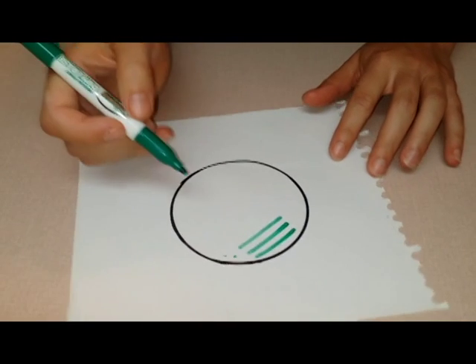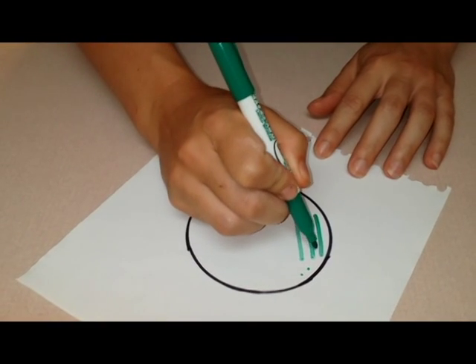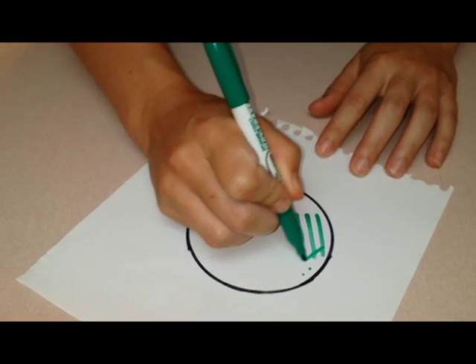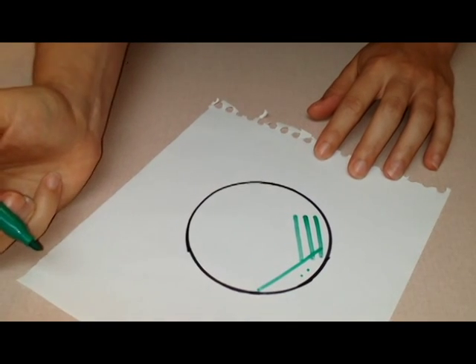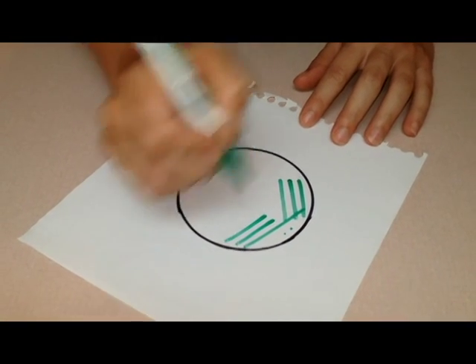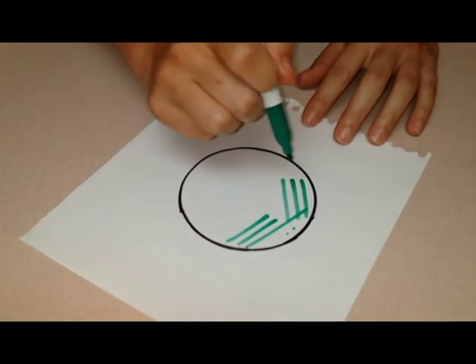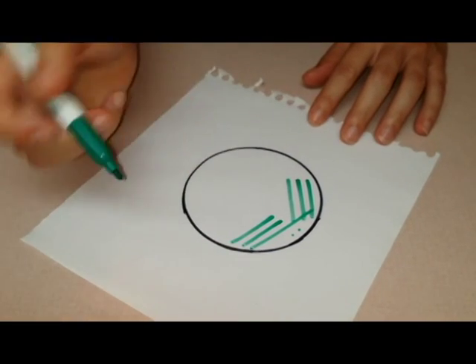Touch it to the agar so that it hisses. And then you streak through those lines and then do two more without touching your previous. This is a way of sort of diluting your culture.